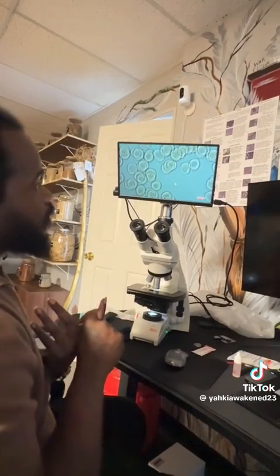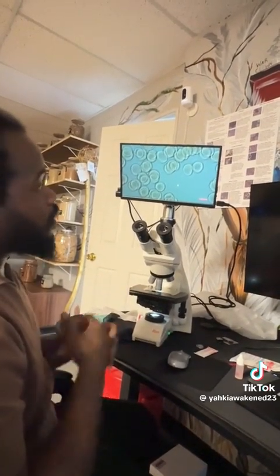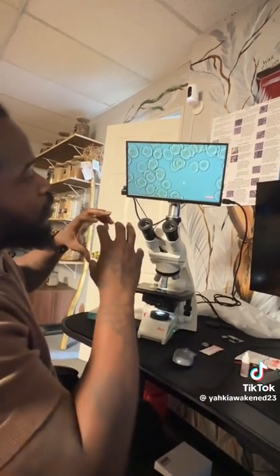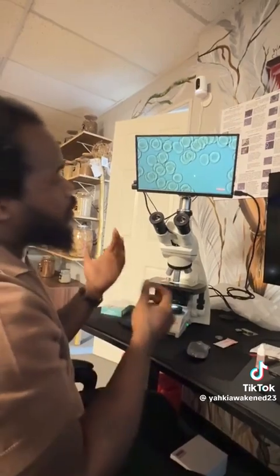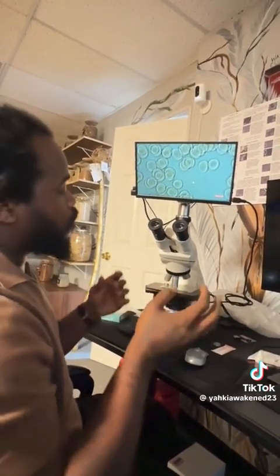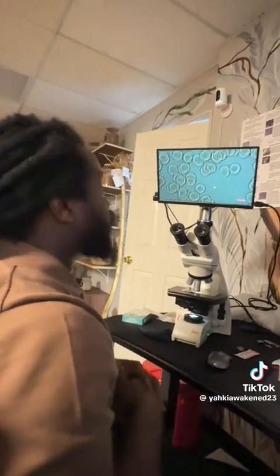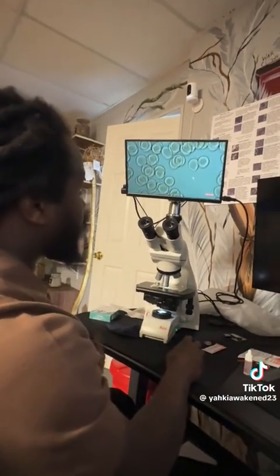The blood is lacking a bunch of oxygen, which is causing coagulation. And I mean, we got a bunch of stuff going on here, but based off of the integrity of the cells and how the cells are shaped and how they're moving or flowing inside of the bloodstream on the sample, I can tell you a bunch of different things that's going on with the system. I mean, a whole bunch. And we got to get rid of this fiber.